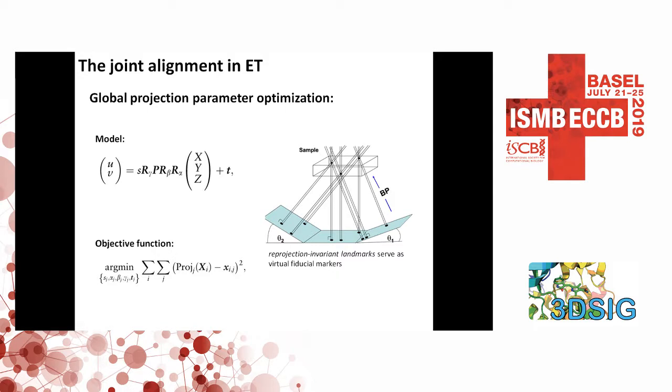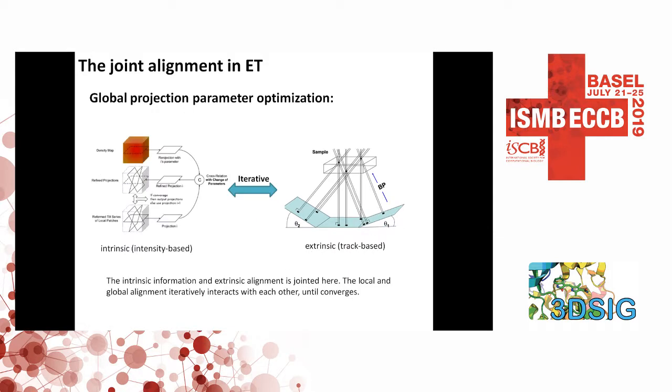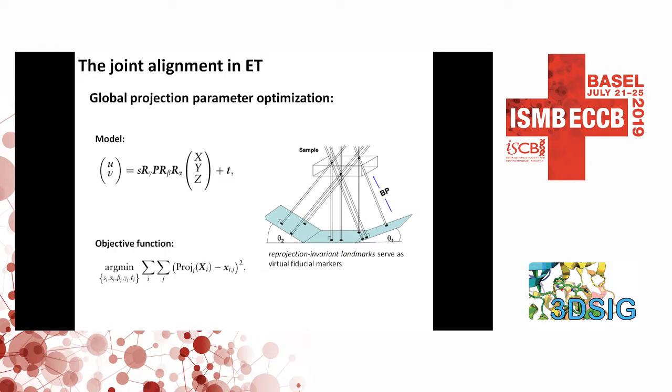However, in the local patch element and in the global element, their parameters are different. For local patches, we have omitted some parameters. For example, as you said, we use a single rotation angle because too many angles make optimization hard.